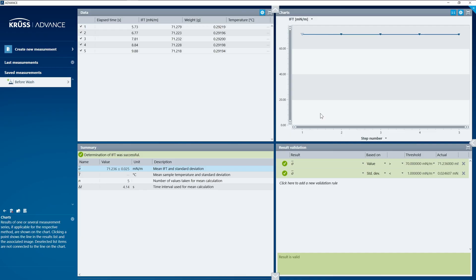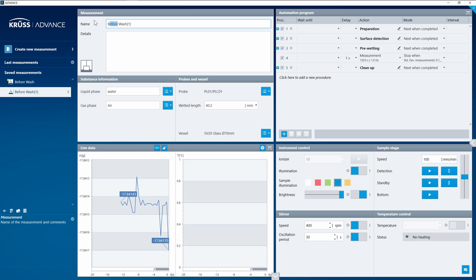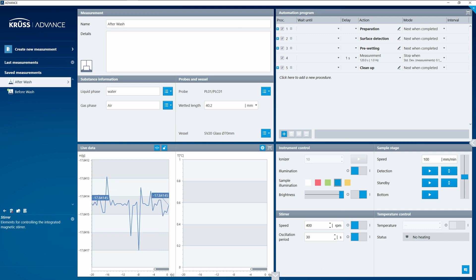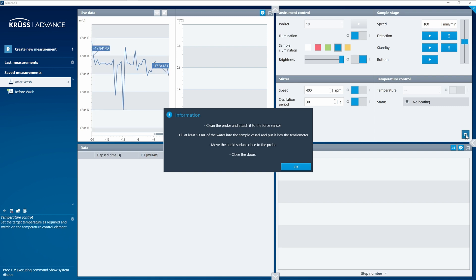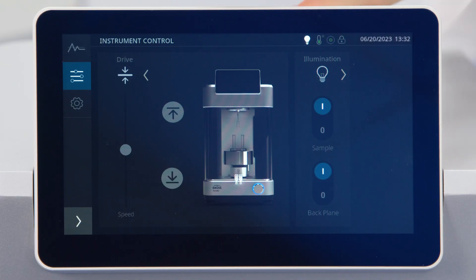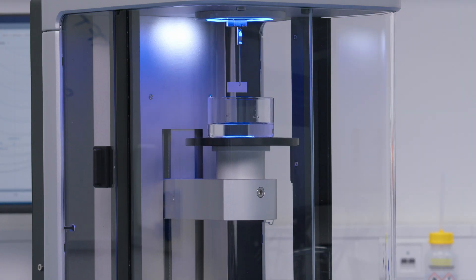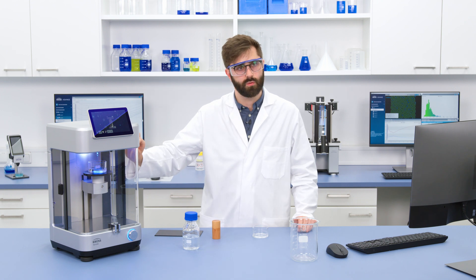Rather than starting a new measurement from scratch, I click to duplicate my first measurement — an exact copy — so all the details, like testing water, are already included. I just change the name to 'after wash' and start the automation. I get the same reminder box for all the steps: cleaning the probe is already done and the sample is already filled, but I still need to move the sample close to the probe. Because I saved the position earlier, I can just tell Tensio to go back to where it needs to be, and it stops just before touching the surface.